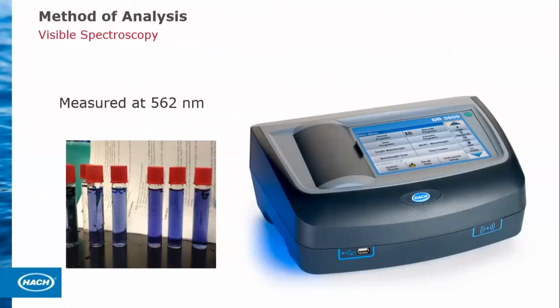That's where we move into visible spectroscopy. By doing a test and measuring at 562 nanometers, we're measuring that maybe pinkish to purple color. And we'll talk about what that is and how that develops. But this is a colorimetric method. Again, it's a grab sample method, and it's so important that there be a digestion.